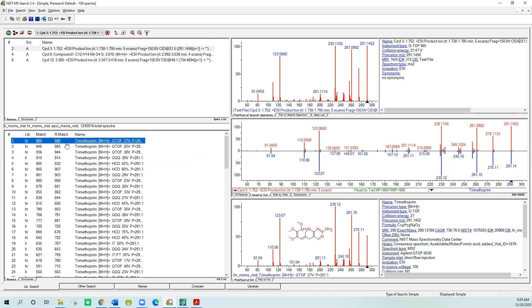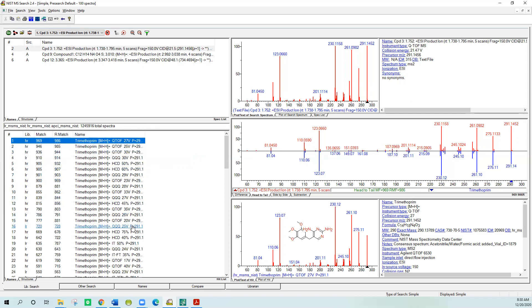But I did search all of those. You can see that it found lots of entries for trimethoprim, and you can see they're just a lot in the NIST library. They'll have it at a lot of energies, just because in general MS-MS spectra are not real reproducible because of the different energies. So they just look at a lot of different energies and they add a lot of different energies to the library. But there's a lot of them to look at here.